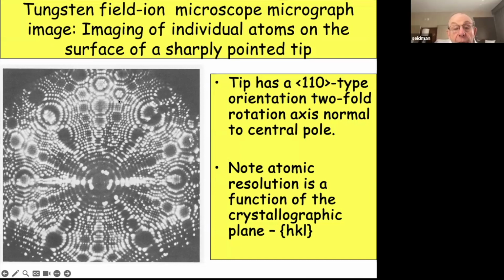Okay, so look at this plane over here. This is a plane, and how many atoms are there? There's 2 and 3, 5. There are 7 individual atoms, and by pulsing it with either electrical pulses or with a laser pulse, you can dissect that atomic plane. And at the same time, you're dissecting other atomic planes. So you collect a lot of information in 3D, and it's possible with algorithms then to reconstruct that information in 3D and then look at the tip and all its atoms on a high resolution screen.